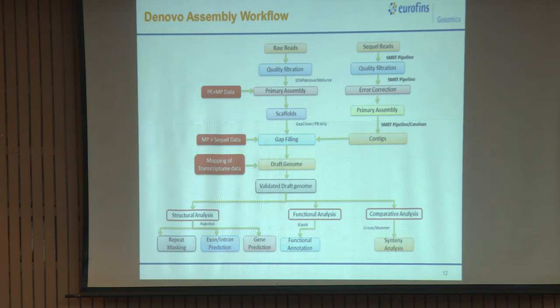Now, what do we do? We use the short reads and map them on the PacBio data using software and correct the PacBio reads. The reads which have more indels or more insertions, where we see any ambiguity, we remove those reads from my data, and then we take all that data together and do a hybrid assembly. In hybrid assembly again we have several stages. First is contig. If I am only using paired end data, I will first do a contig, then I go for scaffolds.